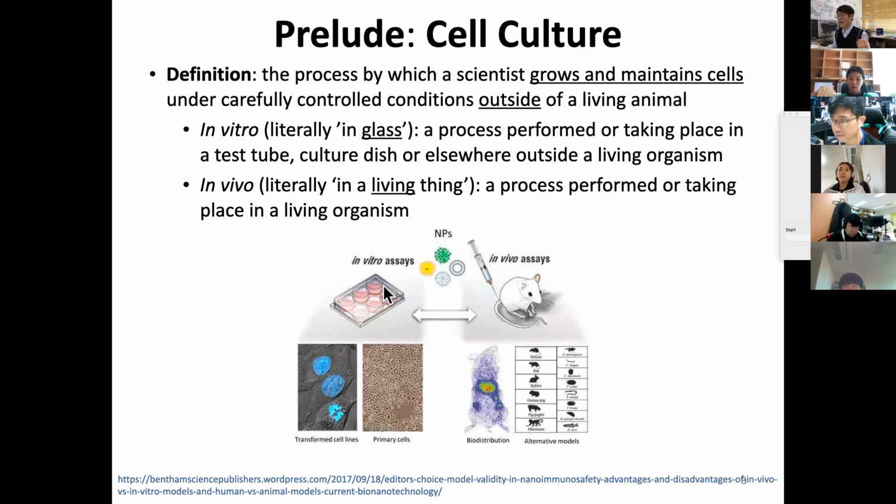In comparison, with in vitro assays, let's say you took out multiple primary cells or transformed cell lines, you can actually have a precise number, let's say 1.1 million cells over here, here, here, here, here, here, simultaneously. Then you do the experiment, and in one experiment you can actually have a 6 data set, which will help you to establish statistical analysis.